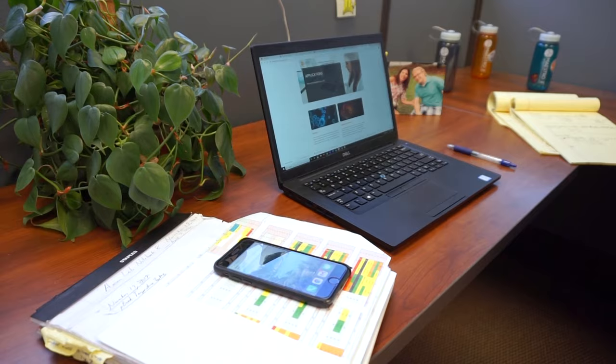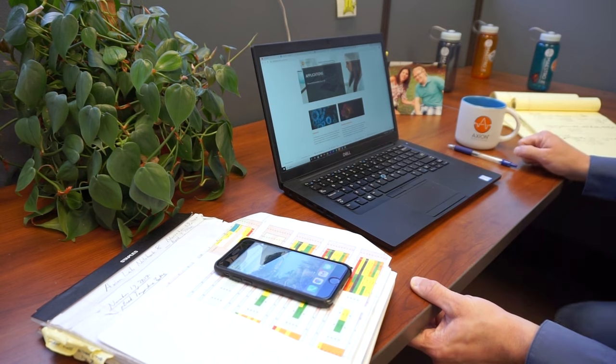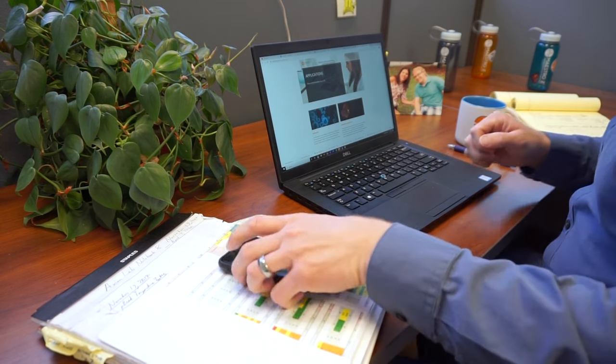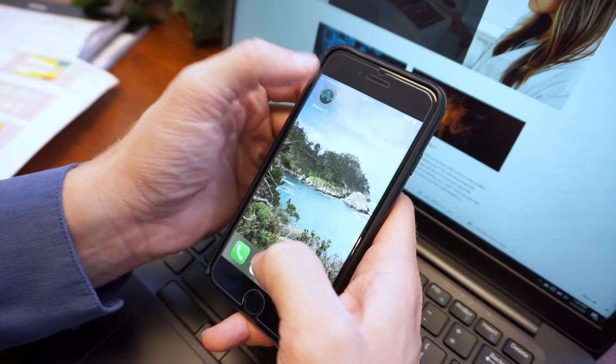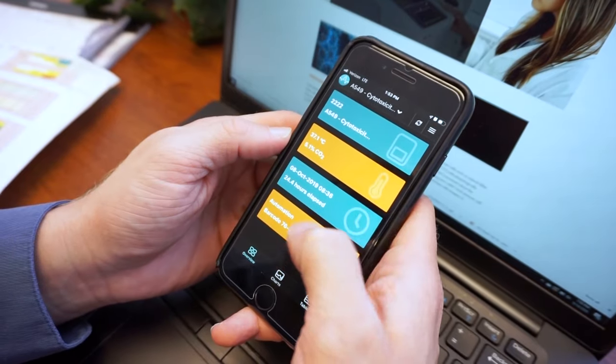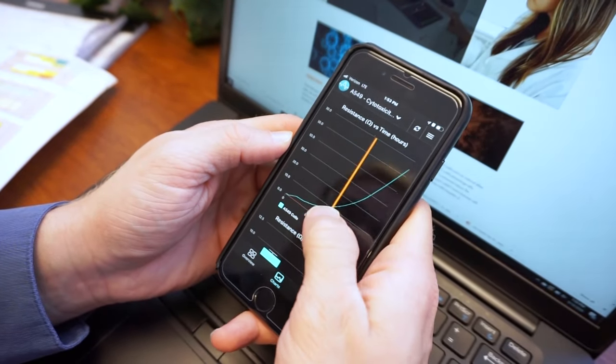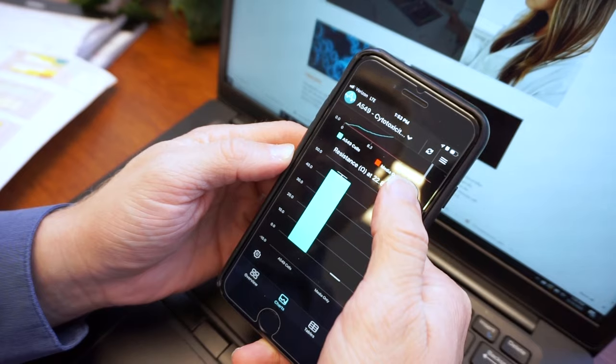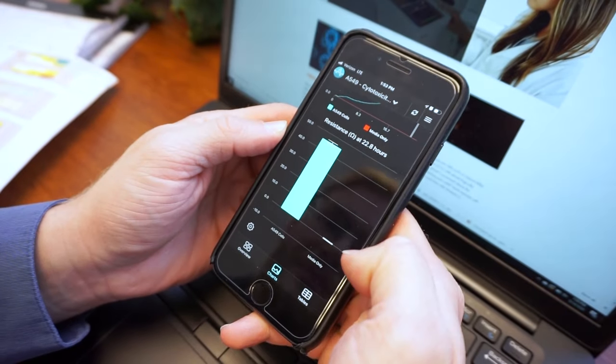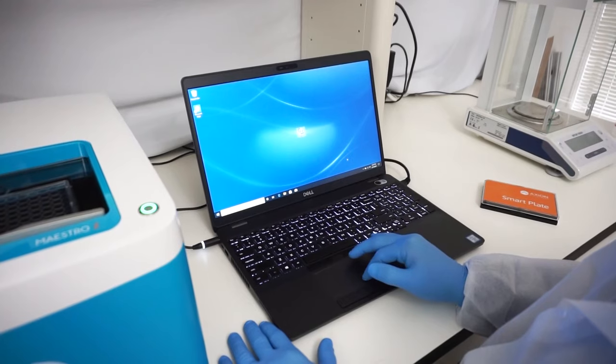With the Maestro Z app, you can monitor your experiment from your smartphone. Check on your cells from the convenience of your desk or even when you're out of the office. Use the cell growth curves to confirm cell health and decide when to apply the test compounds.